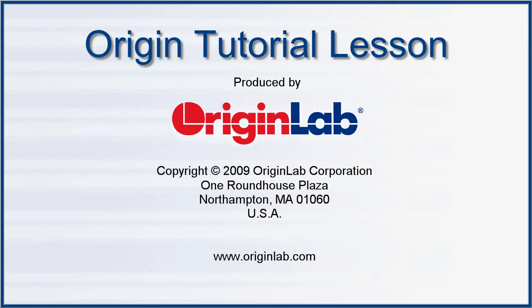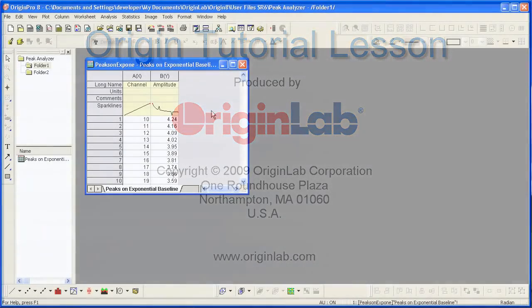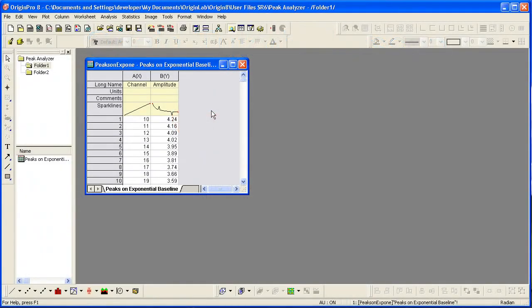In this tutorial, I'll show you how to perform peak fitting using the peak analyzer. I'll also show you how to save the fitting settings to later reuse to fit new similar peak data. I already have a sample data file imported into this workbook.